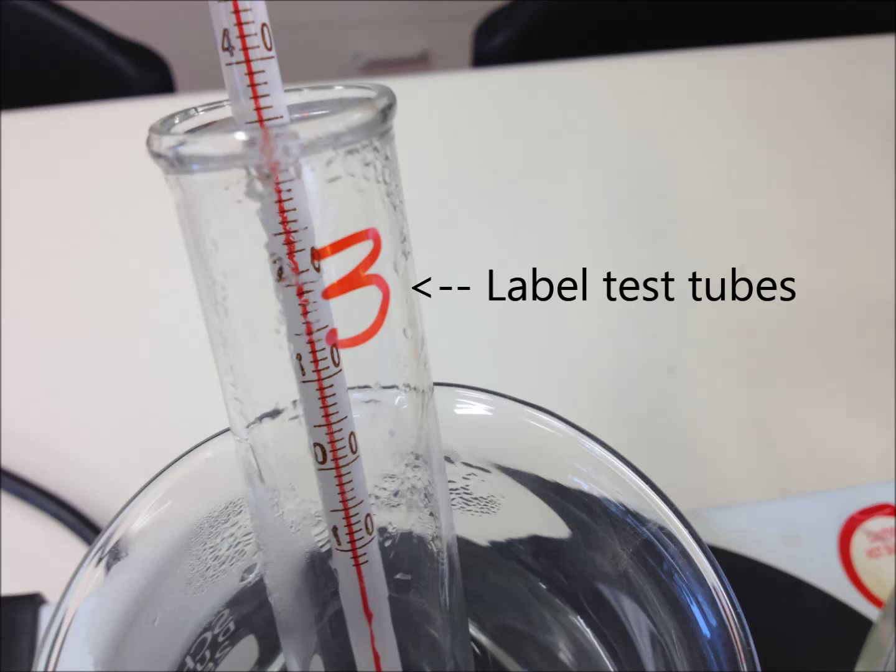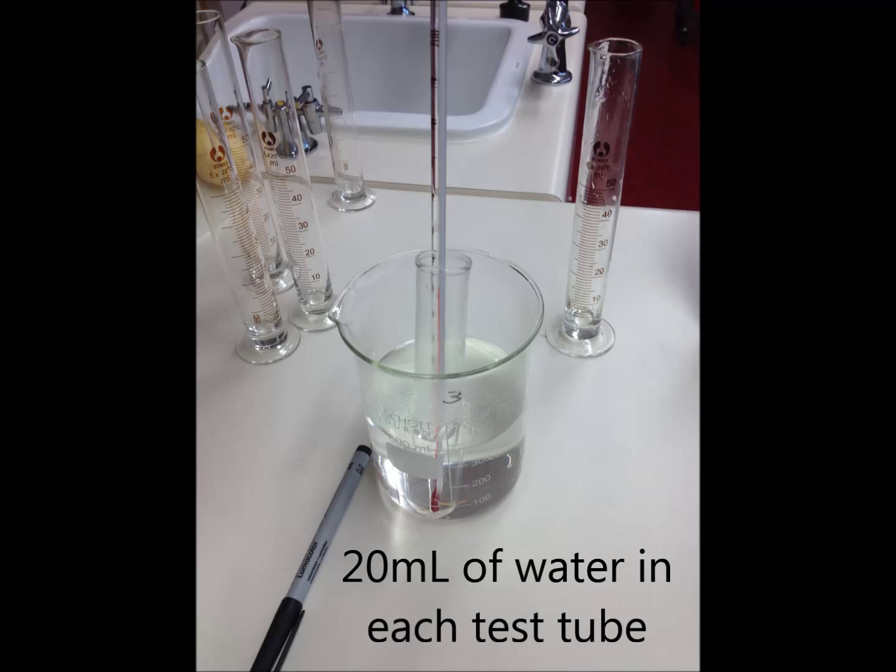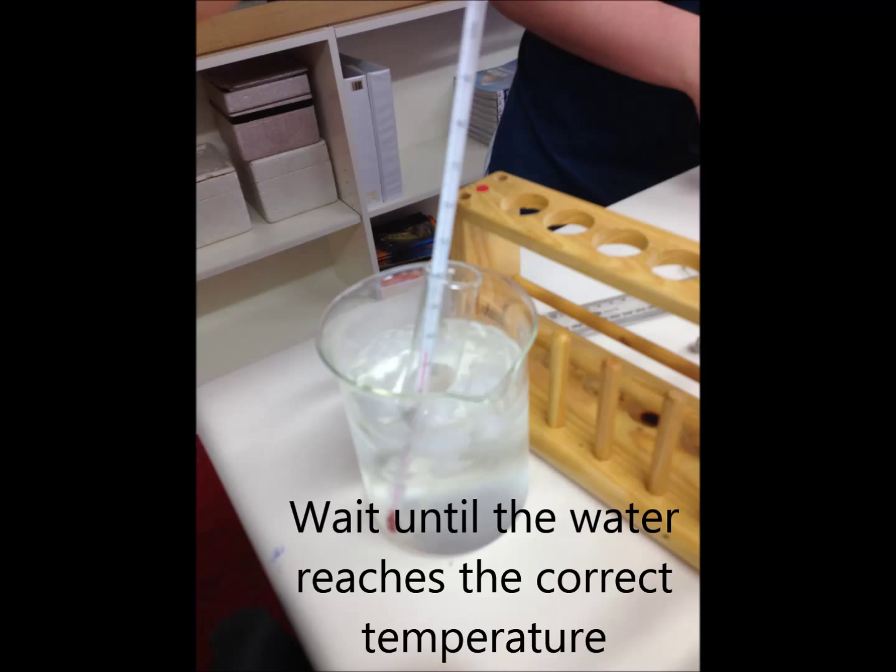Step 3. Place 20 milliliters of water into each test tube, then place each into the appropriate water bath. Insert a thermometer into each test tube and wait until the water in each tube reaches the required temperature.